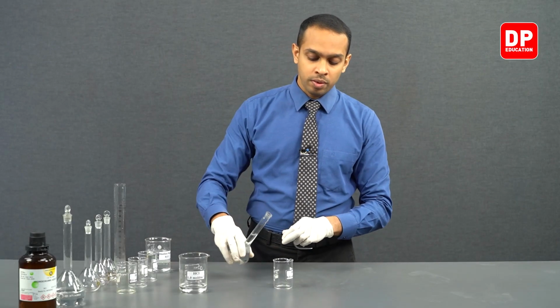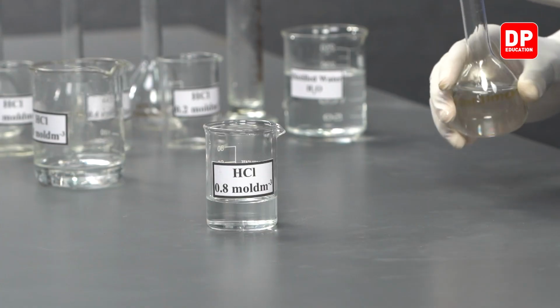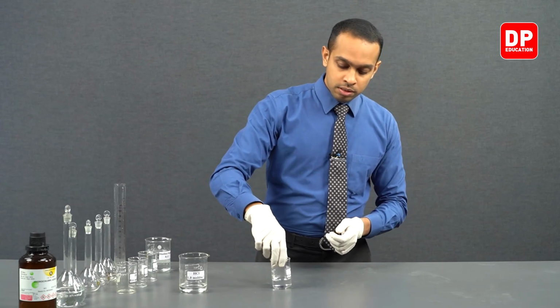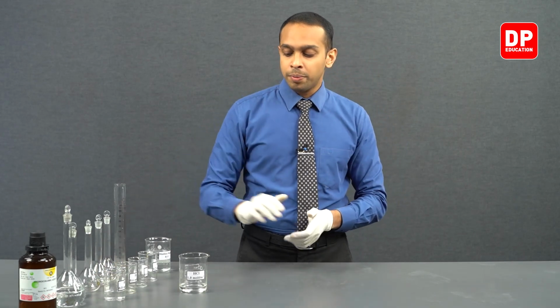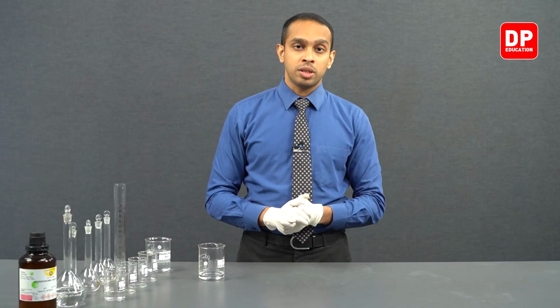So let's transfer this HCl solution into the beaker that is labeled 0.8 mole per decimeter cubed HCl. Now we are done preparing our 0.8 mole per decimeter cubed concentrated HCl.